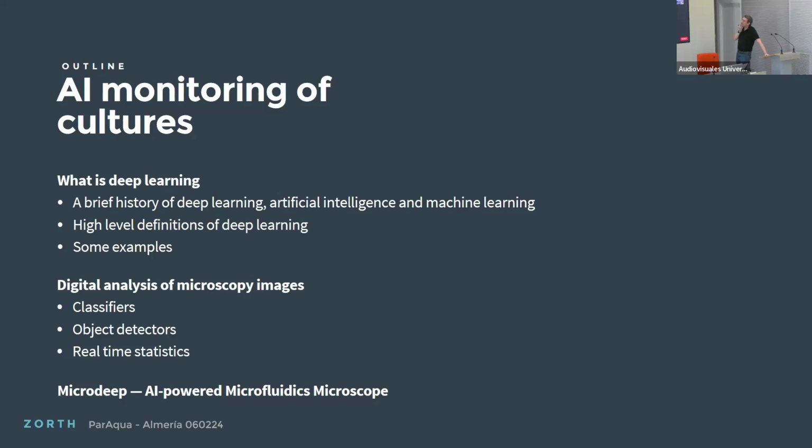Basically, what I do is use AI to monitor cultures and do a lot of things in microscopy. My company is based on something that I devised when I was still a professor in Jakarta at the university, where I didn't have any equipment, and I started to do AI in microscopy, putting some very rudimentary artificial intelligence in place at that time.